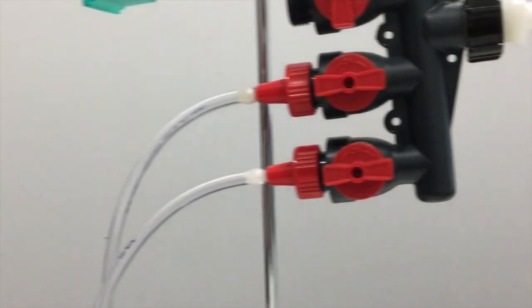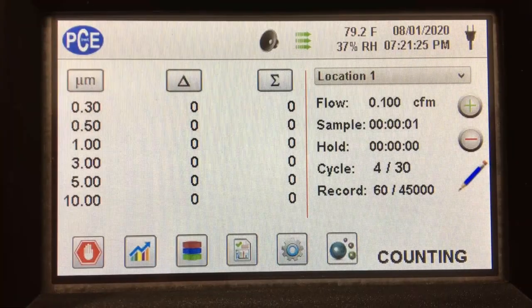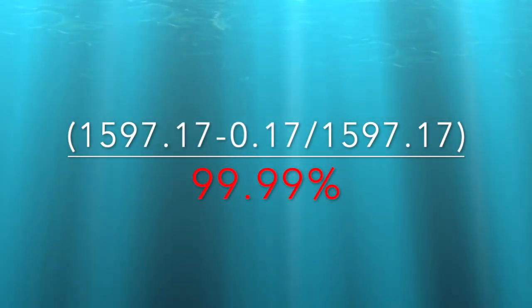We then tested the mask using the same particle counter, pulling the air through the mask and through the filters, and we measured around 0.17 particles of 0.3 microns per liter over 30 tests. This is awesome — it came out to be a 99.99% filtration rate.